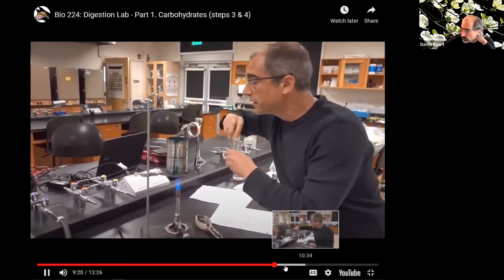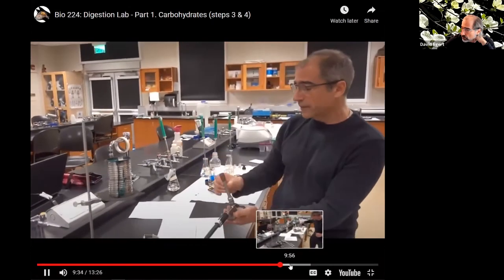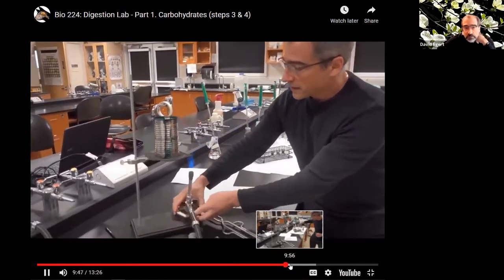We have this in boiling water here. Let's also make sure, when you're using a Bunsen burner, that you have a nice blue flame that's hot. If it's not adjusted, this is not hot, and the water's not going to boil. You want to make sure you have the blue cone of heat.